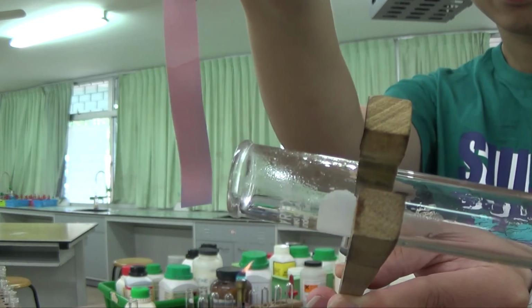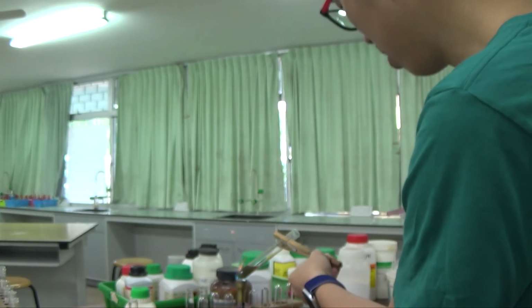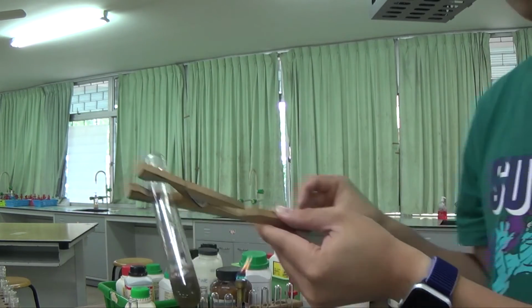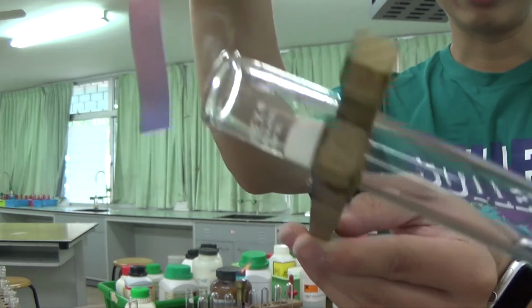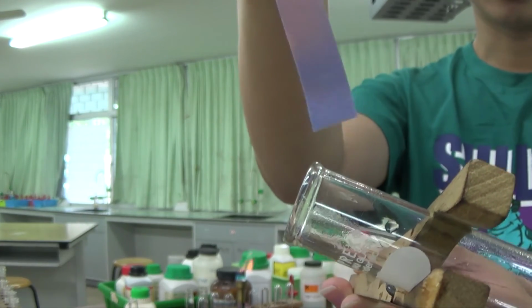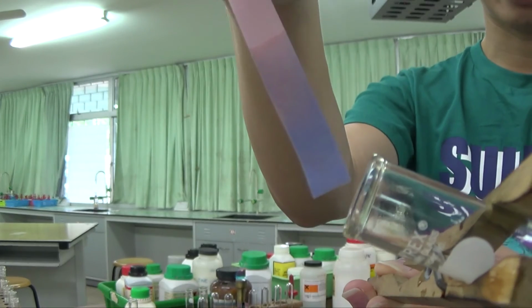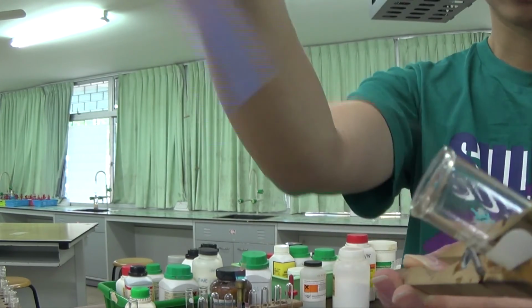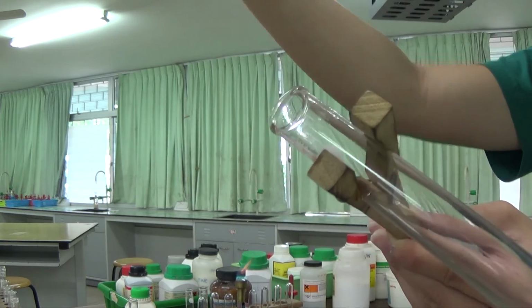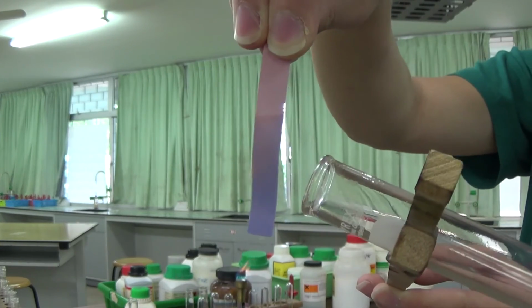Oh no! Okay, I better heat it a bit more. It's not very clear. Oops. Okay, that's why we need to actually heat it in a boiling tube, because a boiling tube is deeper in depth, and a boiling tube can store more volume. So we can see the red litmus paper has turned blue there. I didn't put the red litmus paper inside because it's got sodium hydroxide on the side of the test tube. So I'm just testing for the gas.